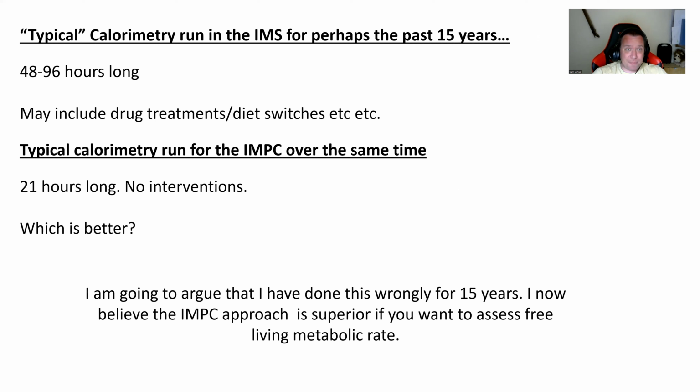Well, the typical calorimetry runs that we've been doing in the IMS for perhaps the last 15 years, so I work in the Institute of Metabolic Sciences, are 48 to 96 hours long, and they may include things like drug treatments and diet switches and all sorts of other interventions into the animals.